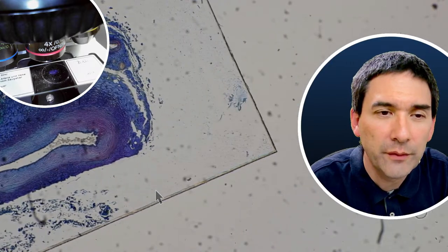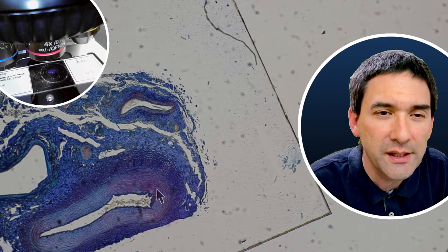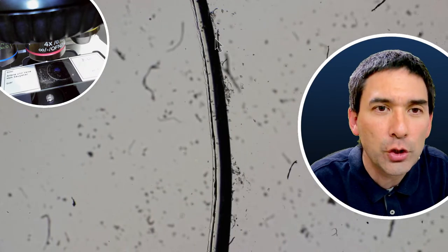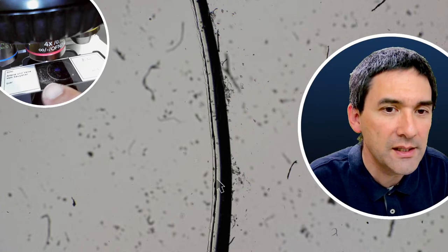So, kind of interesting, one of the things that I noticed is the following, and I don't know how they've done this, something I'm going to research. Notice that over here, this is the edge of the cover glass. It's a round cover glass. You see it also here in the corner, right? It's the edge of the cover glass.